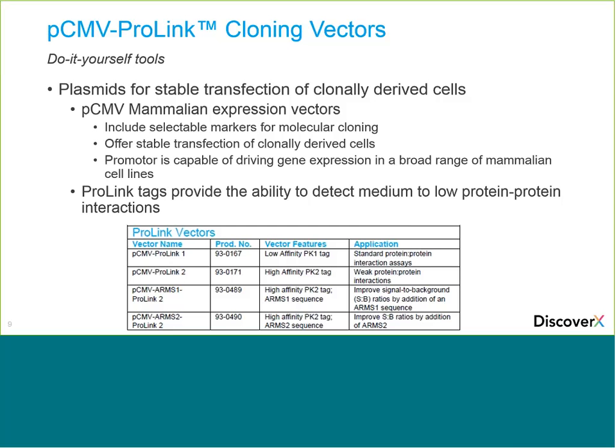So let's look at this a little bit more in detail. You start out with the cell line, go to the cell pool, and then at this time, once you've done the confirmation, I would recommend moving to the full right and creating your stable cell line. Then moving down to the cell pool, do the confirmation, and then move all the way to the left to create a stable cell line. And this final cell line is definitely used for the quantitative beta-arrestin recruitment assay.